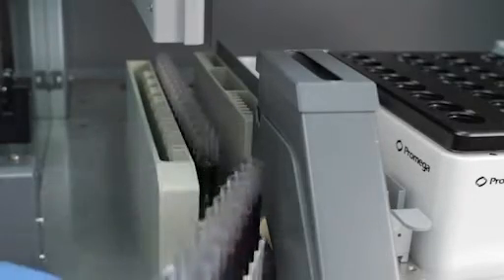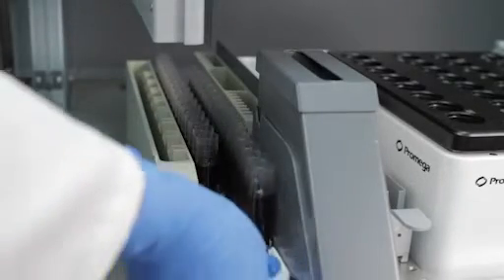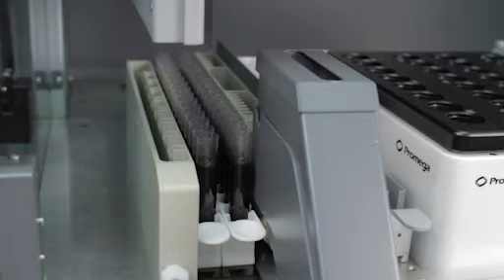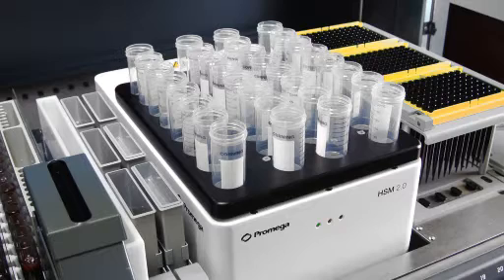The instrument can transfer samples from uncapped primary sample tubes. Sample transfer takes one hour or less. Alternatively, samples can be transferred to processing tubes manually and then placed on the instrument.